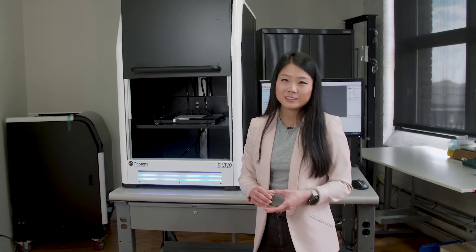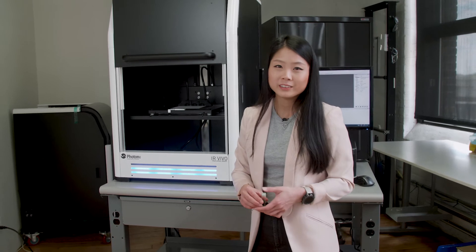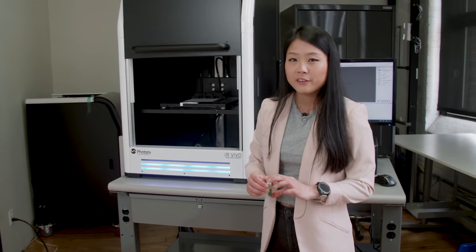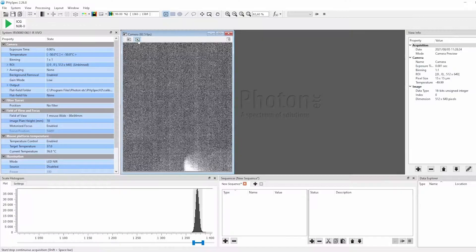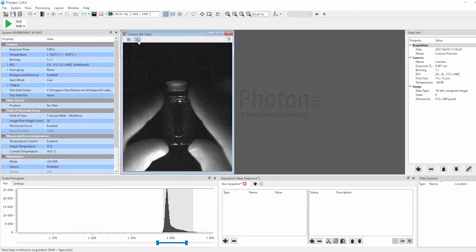So all that being said, let me show you how quickly and easy it is to take an acquisition with the iRevivo. I have a sample here of ICG in a cuvette. ICG is known to have a good emission tail in the near-infrared region.